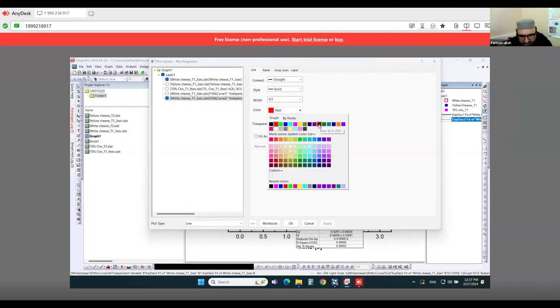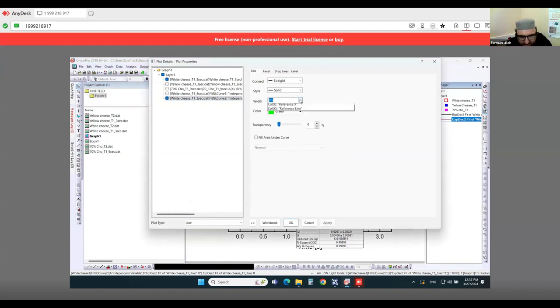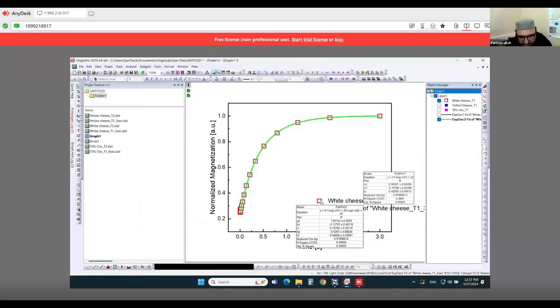I will take some other color. Let's suppose this one, okay.